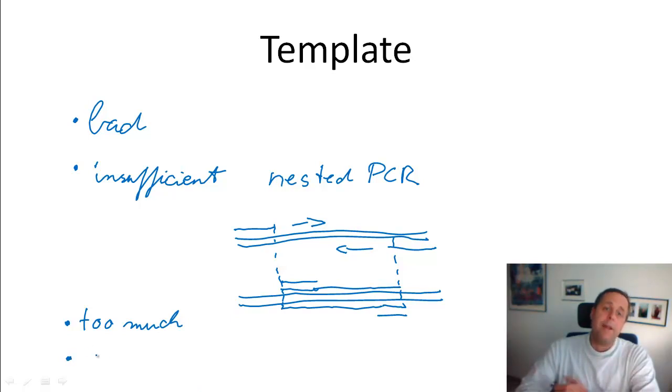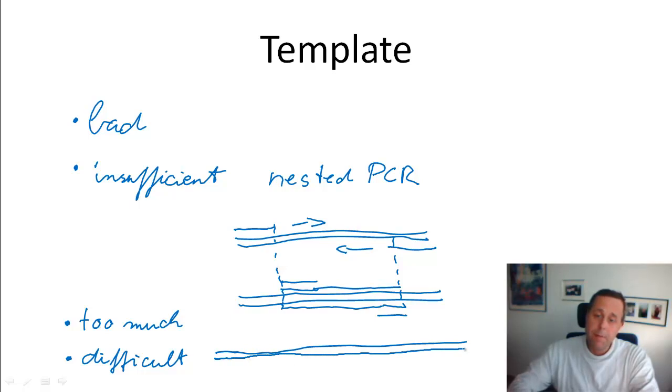And finally, it can happen that your template is simply a difficult template. What's a difficult template? Well, maybe it's clean DNA, sufficient amounts, but not too much. However, what happens is that perhaps in your template DNA, you might have a GC region.